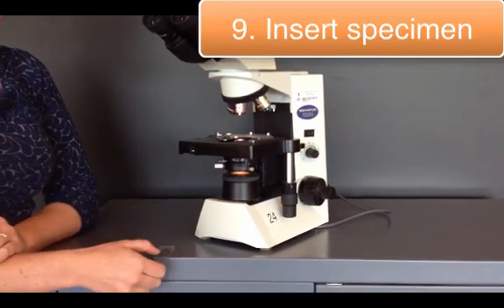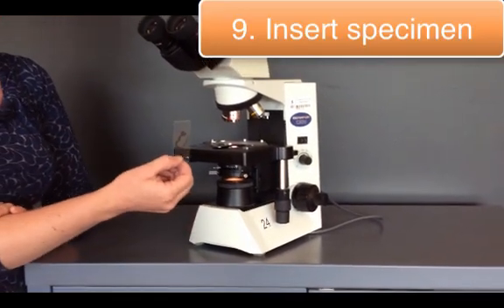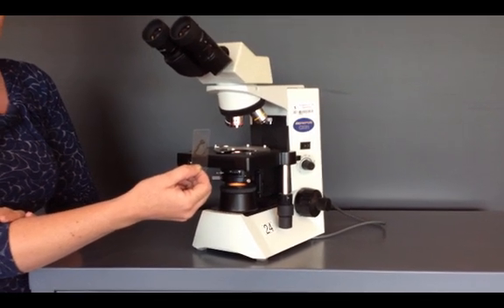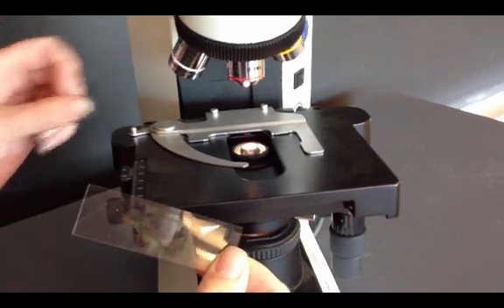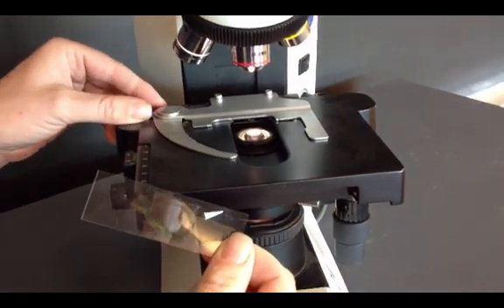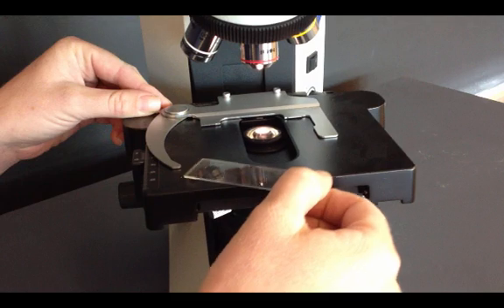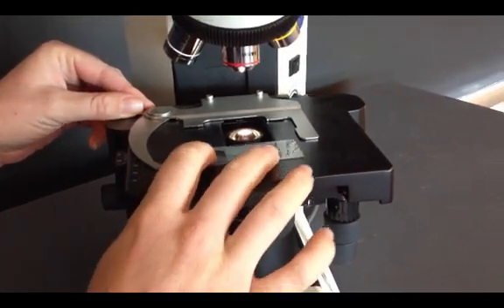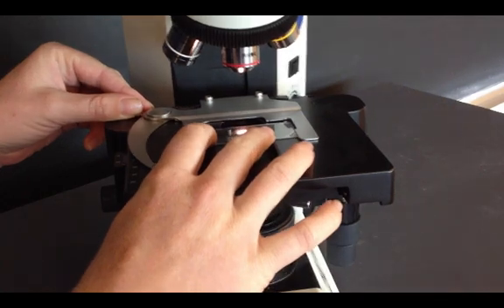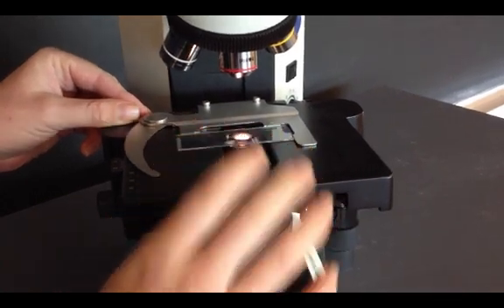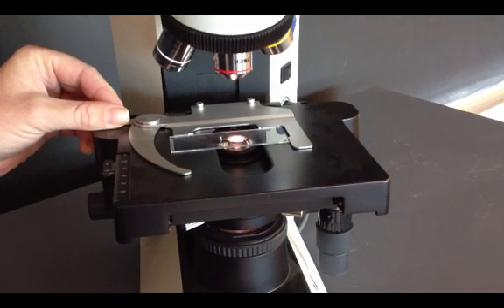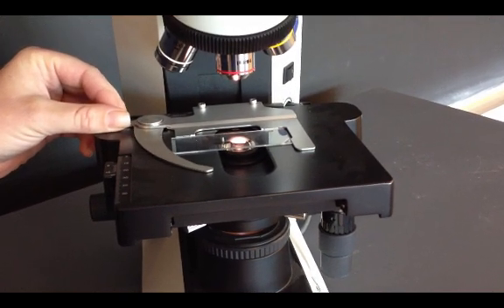Then you're ready to put your slide in. Grab your slide on the side, being careful because they are glass. Then open the slide holder and gently push your slide into the back of the microscope. Slowly let the slide holder close. If you just let the slide holder go, it may slam against the slide and crack the glass.